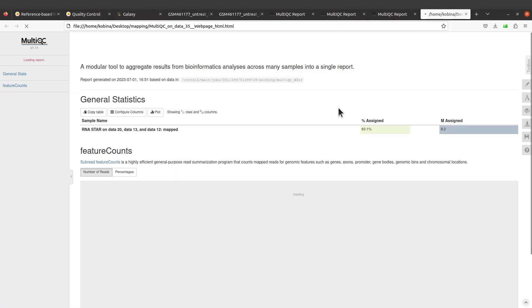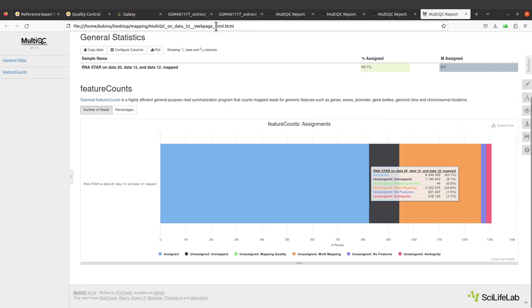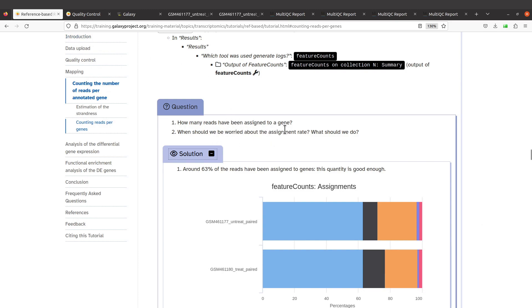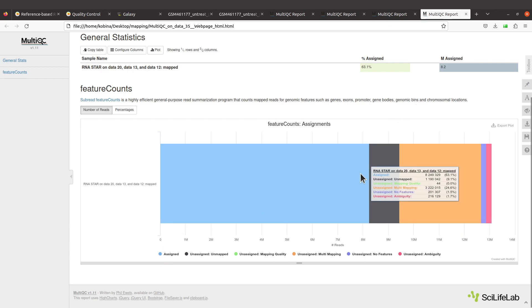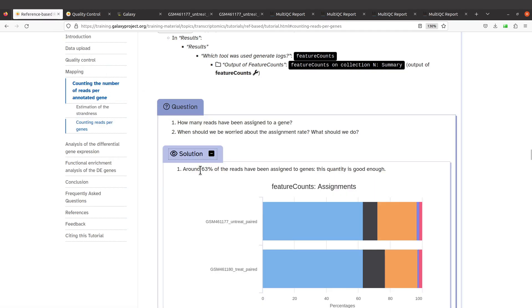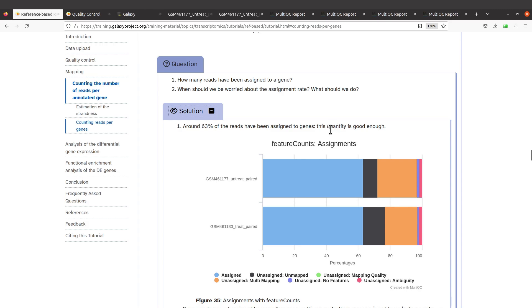I have my feature counts reports here. The question asks: how many reads have been assigned to a gene? Using the color scheme and hovering the mouse over the plot, I can see assigned is 63.1%. So around 63% of the reads have been assigned to genes for our sample. The Galaxy tutorial page confirms that this quantity is good enough to proceed.